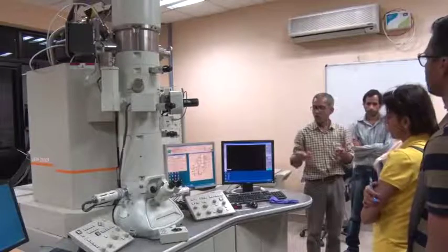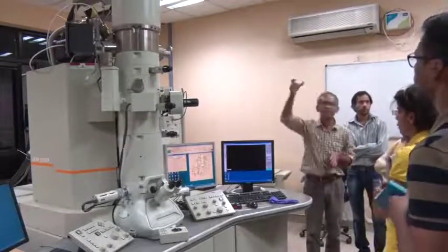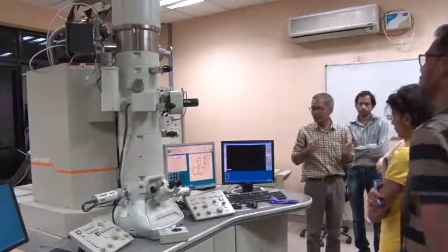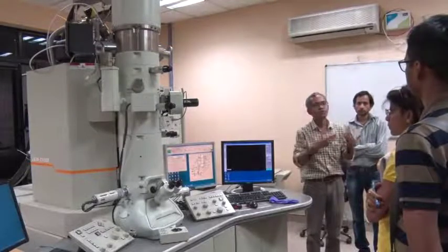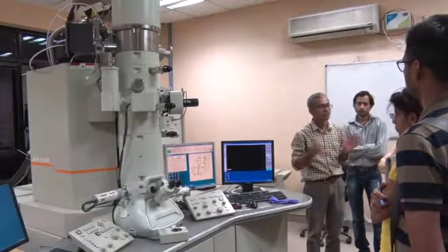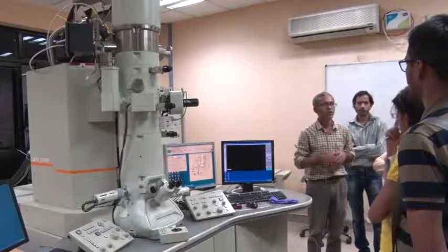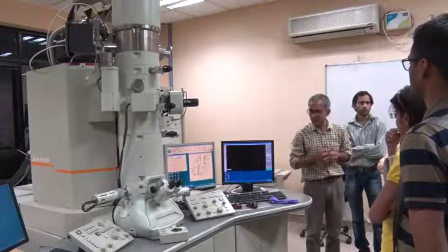So that will involve the objective lens, where we standardize it, then we center the condenser aperture, set the Z height of the sample, followed by objective lens centering and objective astigmatism. So these are the 5 steps. The first 3 we do at low magnification, 20K, 40K, like that, and then the last 2 we will do at slightly higher magnification, 100K. Okay.